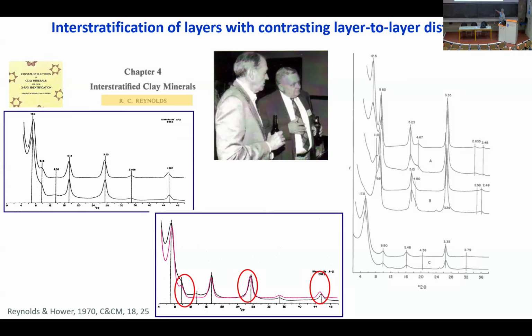And this is the high angle region, where I have the most accuracy on peak position. Also, you can see that I have a discrepancy between what they measured in black and what they calculated as their identification in purple.